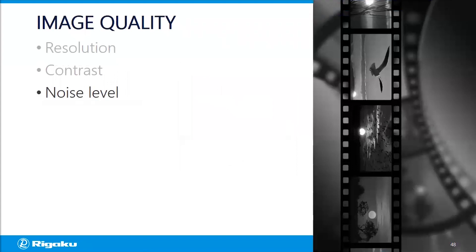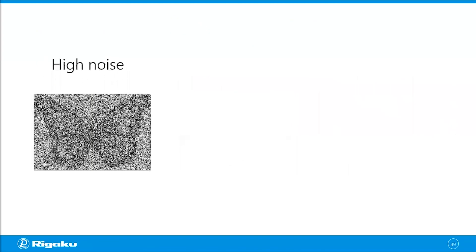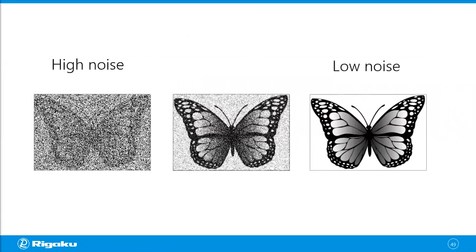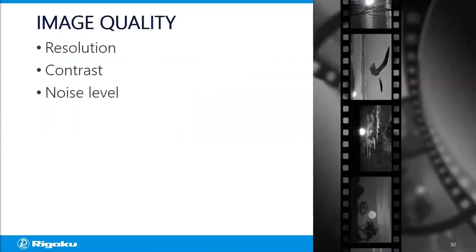The last factor is noise level. This is a really noisy image — you can barely see what's in it. This one is a little better, and this one is a lot better. When it comes to noise level, the lower the better. So resolution, contrast, and noise level are the three important factors when thinking about image quality.